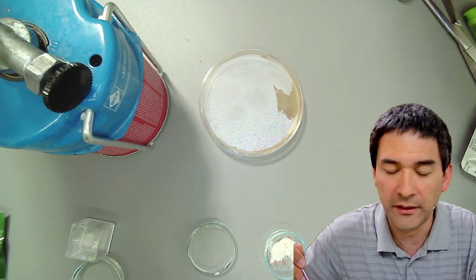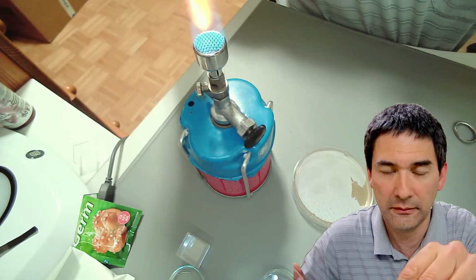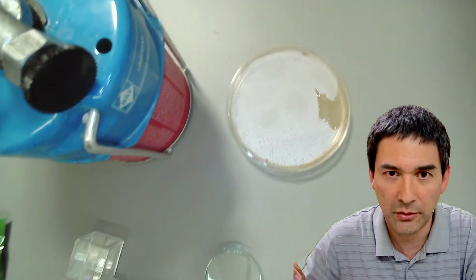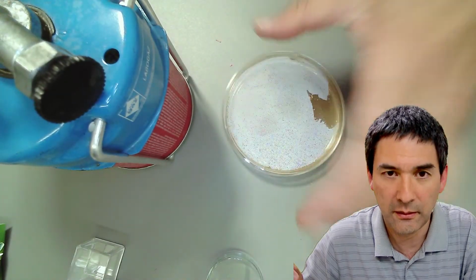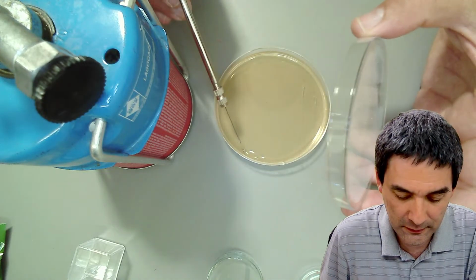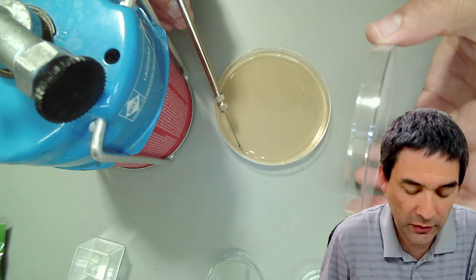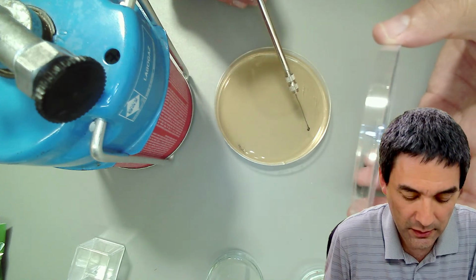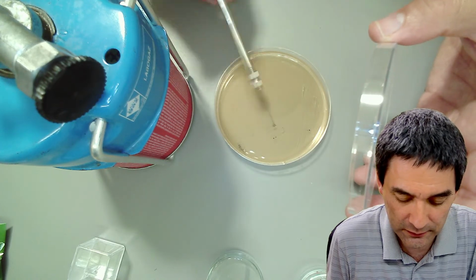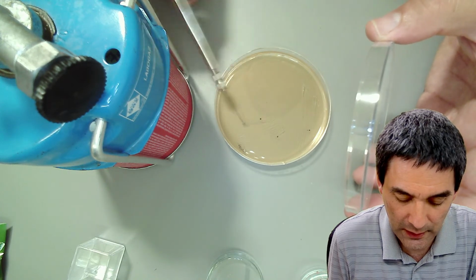You cannot see it now because the camera is pointing away. Okay. Yeah. So yeah, but you know what I'm doing. And I'm going to now cool it off again. Now I'm going to go into the streak, I'm going to pull over, and I'm going to spread it again.